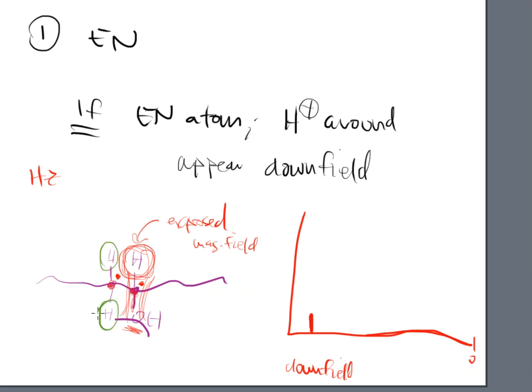because they're not as exposed, that means the magnetic field that we place on them is not going to grab them that strongly. As the machine begins to flip the hertz, one after another, after another, it doesn't take as many pushes in order to get those to flip all the way back down. Because we don't have to do as many pushes, we actually see a signal more upfield, meaning closer to the 0 mark. That is what this is all about.